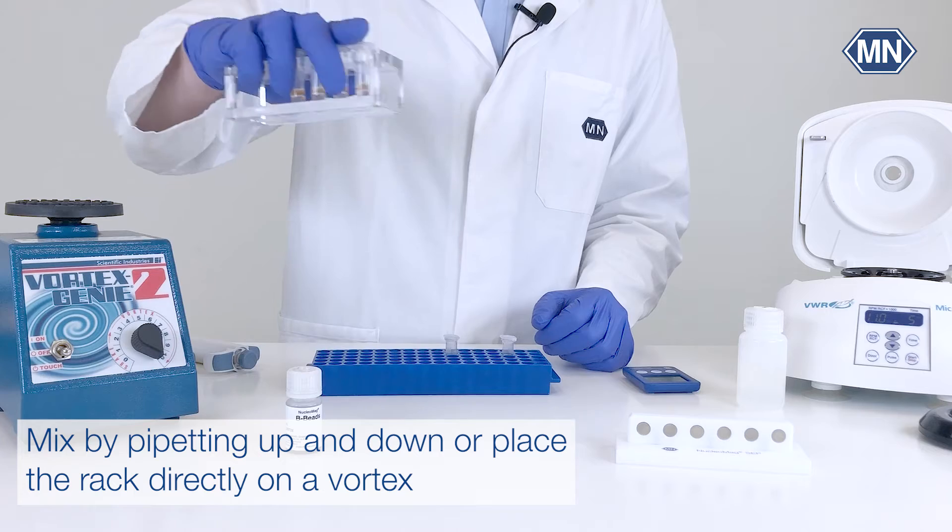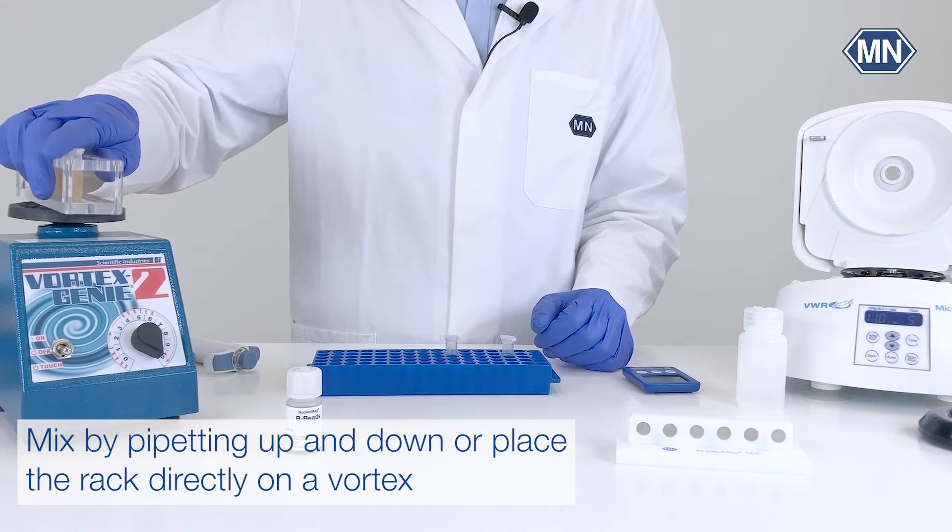Mix by pipetting up and down, or place the rack directly on a vortex, and subsequently incubate for 5 minutes at room temperature.